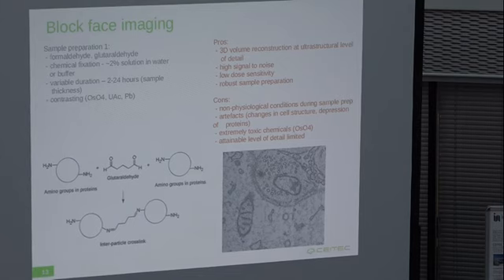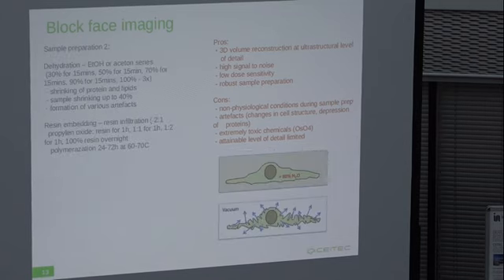You incubate that with your sample for a certain period of time based on the volume of your sample. And then you use additional chemicals for fixation in order to stabilize the membrane. You use primarily osmium tetroxide to stabilize and contrast the membranes. You can further enhance the contrast of the proteins by uranyl acetate or, subsequently, for instance, by lead citrate. Then the sample undergoes dehydration.